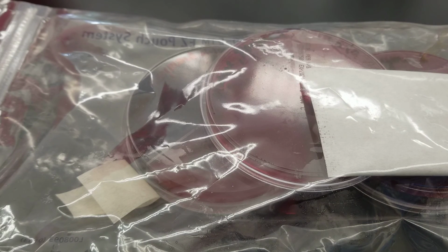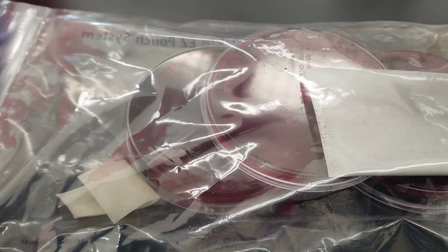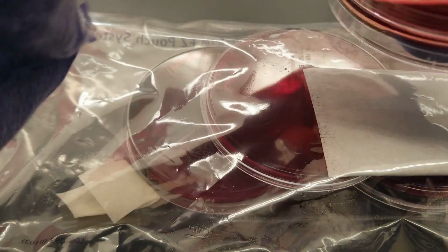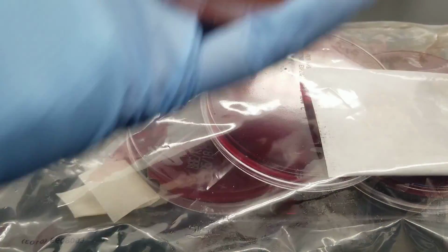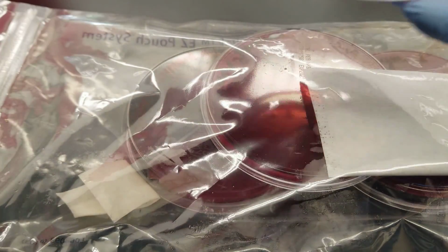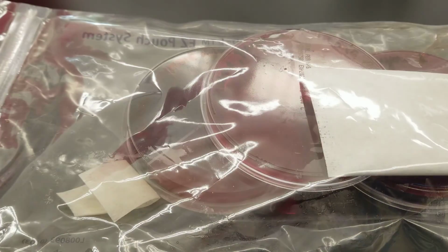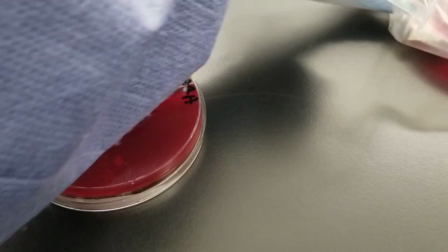And so you should pretty much figure out who that is. But if you look at our aerobic setup, there was nothing. Again, that's because it's from a pure stock culture. In reality, we wouldn't do this on this type of specimen because obviously there is no need, but this is learning, and so we're going to do it to practice.